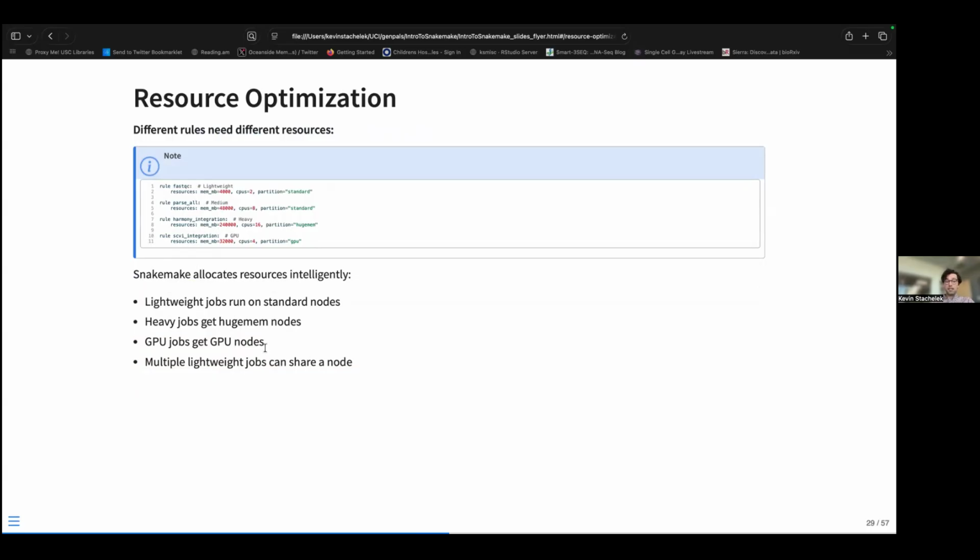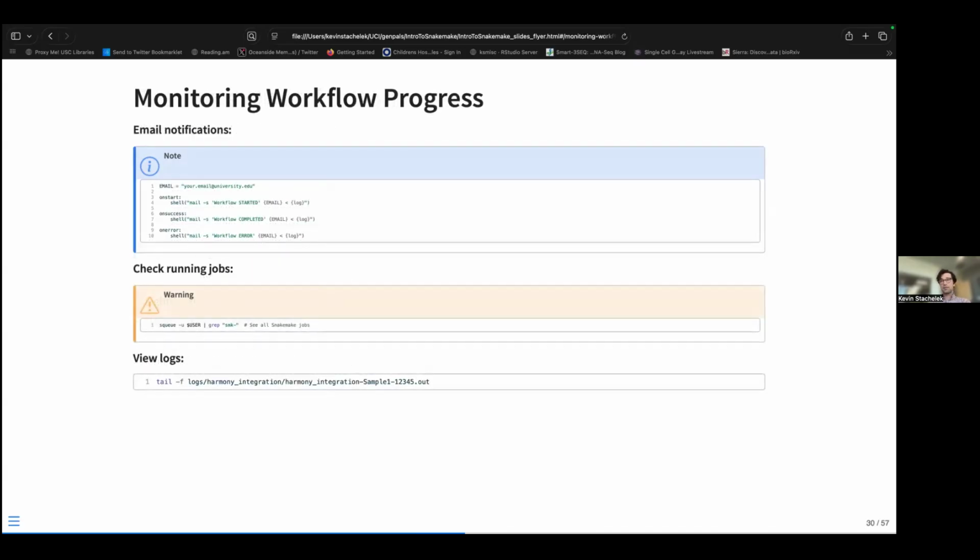And you could even specify, and I have done this in some cases, using CPU or GPU partitions. For example, if you happen to be able to speed up some small portion of your pipeline by using the GPU partitions, which I think are otherwise often underused, you can do that and not have to write separate steps.